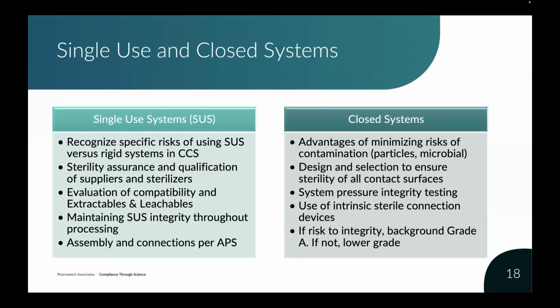Obviously, your exposure time is a lot less, so it's somewhat simpler extractables and leachables compared to a container closure integrity type, but still certain requirements. And this also includes elemental impurities, so don't forget that.